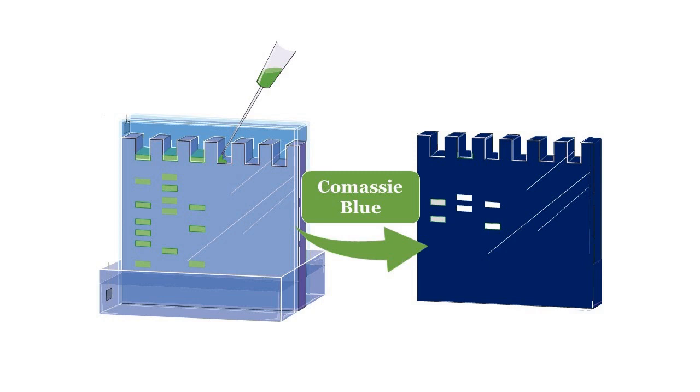The technique involves separating a mixture of proteins or nucleic acids using gel electrophoresis and then incorporating a substrate for the target enzyme into the gel.